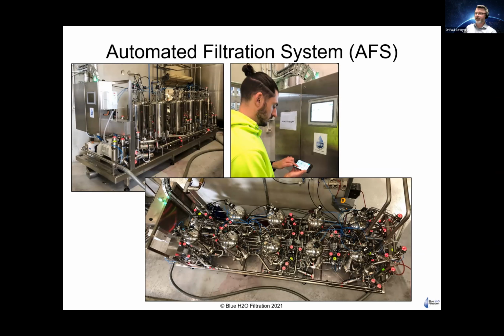And the whole thing can be run from a smartphone in terms of actual production or sanitisation or integrity testing. All of that can be done remotely, which is really the way of the future for these sorts of things. So you will see more and more of these as you go around.